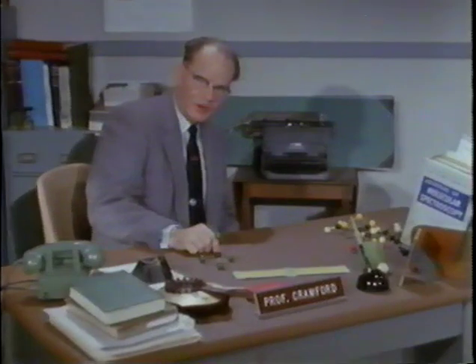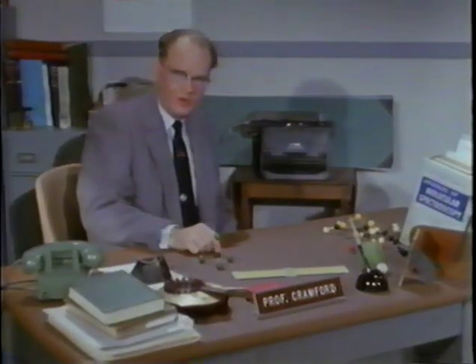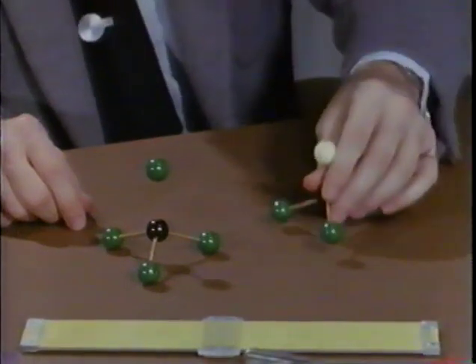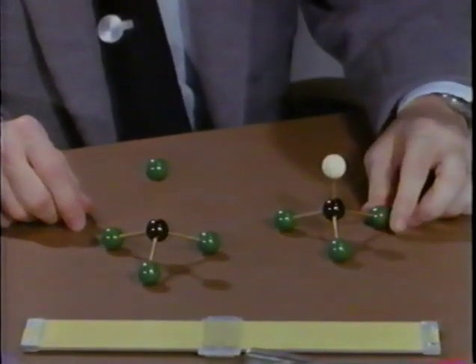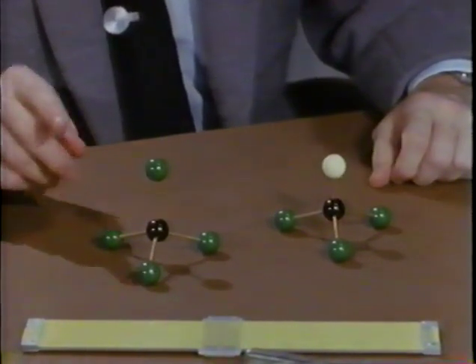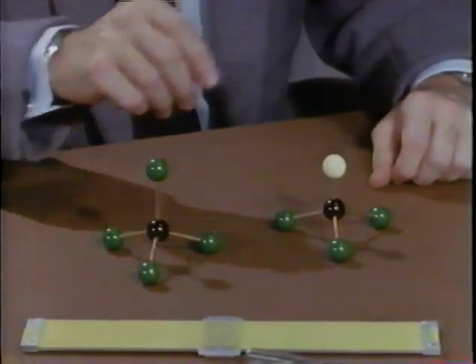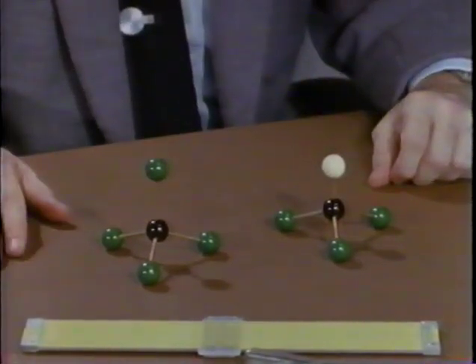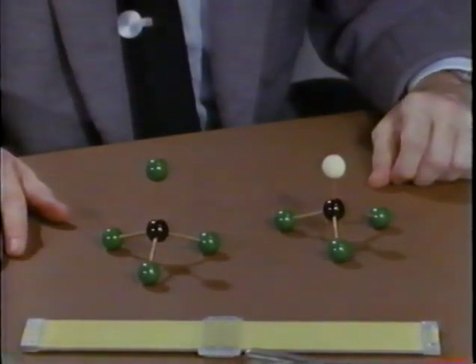A carbon tetrachloride molecule. It will have its own infrared spectrum. A chloroform molecule, which differs from the carbon tetrachloride only in that one of the chlorine atoms has been replaced by a hydrogen atom, will have a significantly different infrared spectrum.